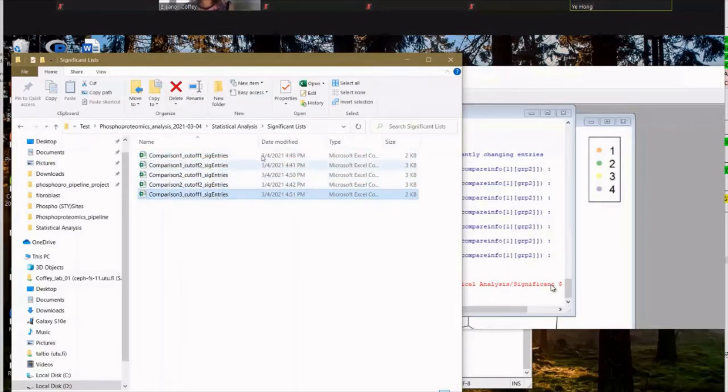It's going to pick up these files, do the enrichment analysis and network analysis for every single list here. So if you have a list that you didn't want to use, from the beginning choosing part, you can just say no, I'm not choosing it, because all of them will be analyzed later.